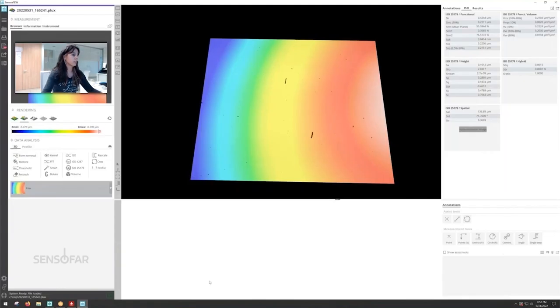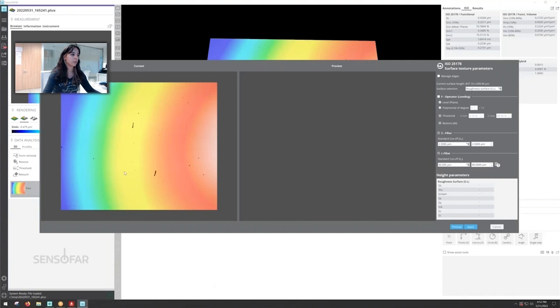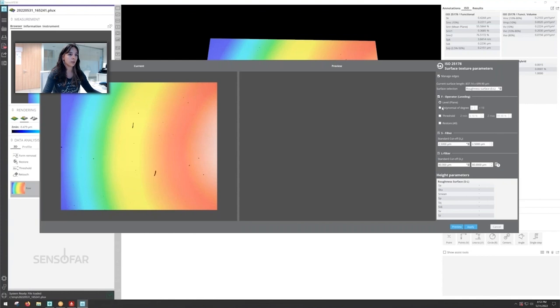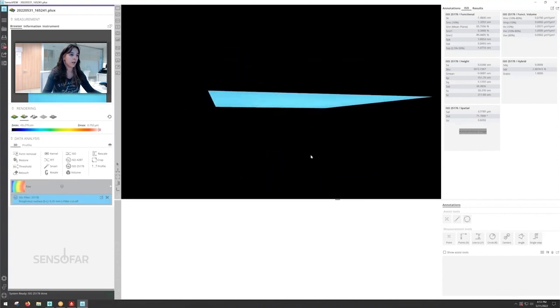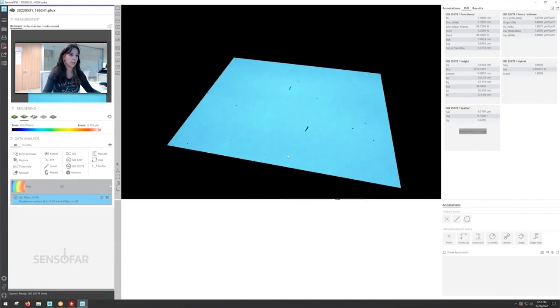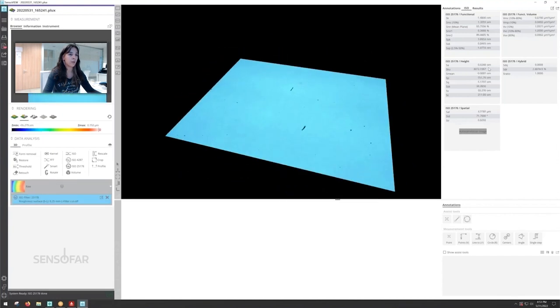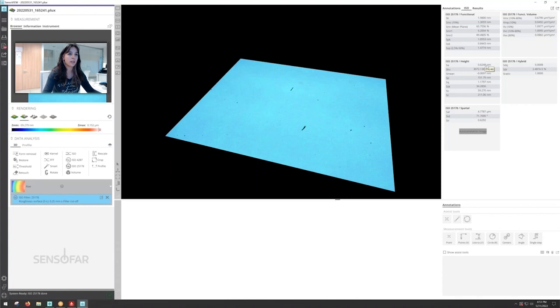You can see on the bottom of the screen the nine steps that phase shifting interferometry takes into consideration. So this is our surface. Now we need to remove the shape and we're going to apply the filters on the ISO 25178. We're going to take out a polynomial degree of 2, an S filter of 2.5 microns and an L filter of 250 microns and the result is going to be a surface without any shape.